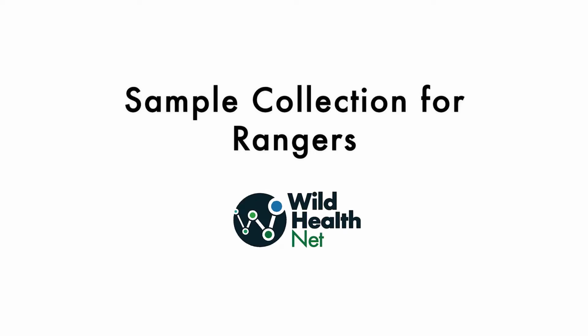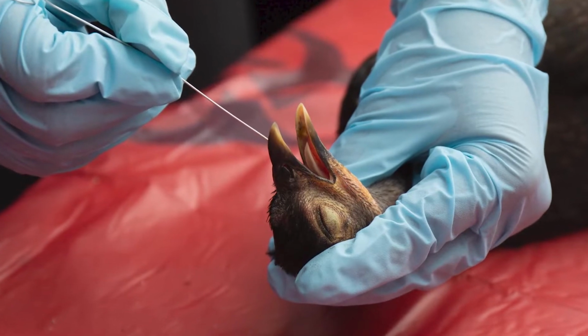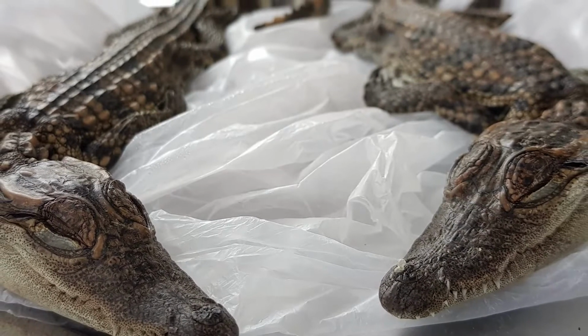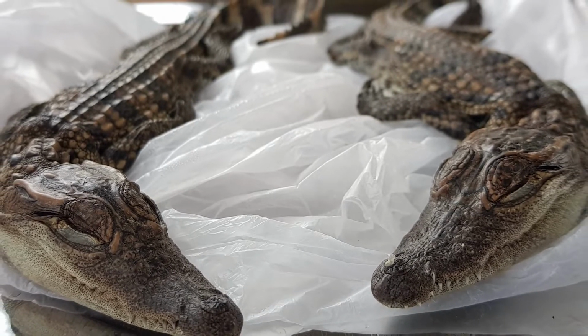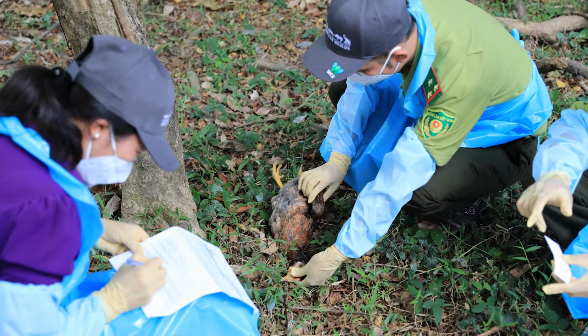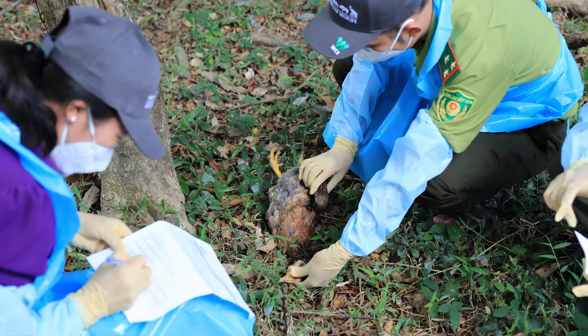This video will show you how to collect carcasses and gather valuable samples to aid in wildlife health surveillance. Even just a few dead animals may be the sign of a disease outbreak, and it is important to gather information to understand the cause and potential consequences of the outbreak.